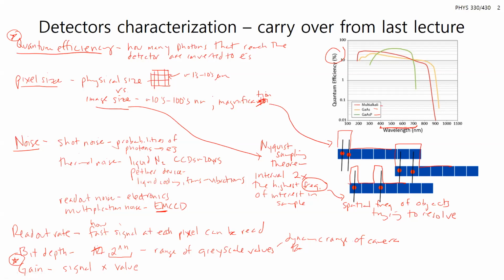Okay. So now we can move to the main topic of this lecture, which is focusing on detecting. We're going to start the discussion of single molecule detection. And the big question is, why do we want to go through the effort of detecting single molecules? So that's one of the goals. We'll address why you want to measure single molecules. There are different ways to do single molecule measurements. We're going to be focusing on fluorescence microscopy.